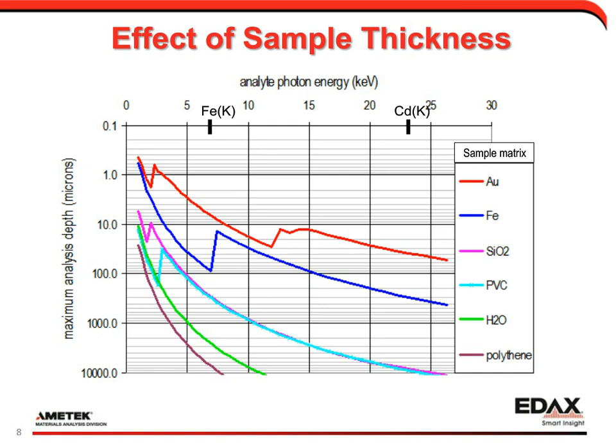And if we analyze a higher energy line, something in the range of cadmium, we have analysis depth exceeding 1 millimeter. So the range can vary a large amount depending on the energy of the analyte element and the actual matrix of the sample.